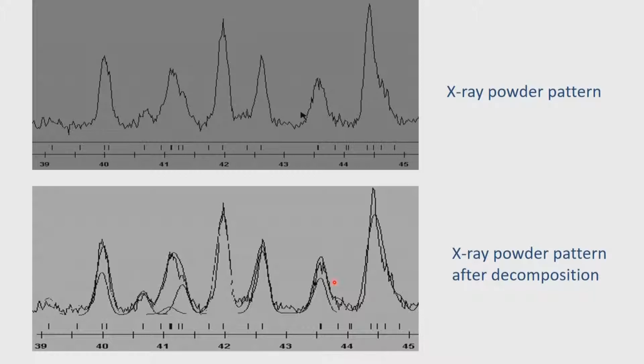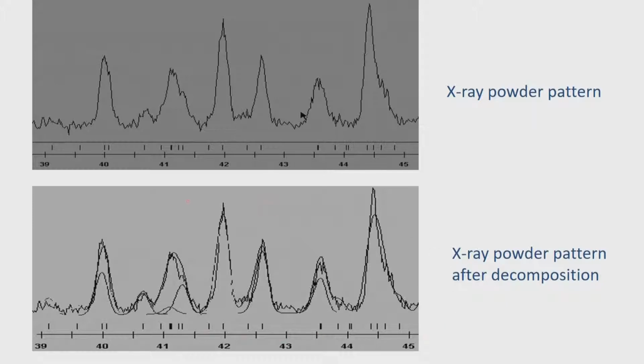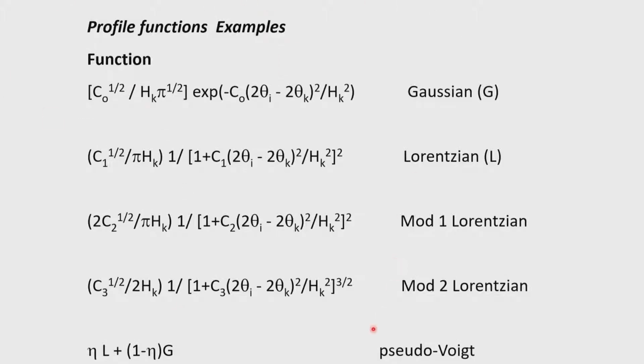So let us go further, and we see here the types of profile functions we can fit. We have to get a function which looks like this. Let us take this function, this is the profile associated with this reflection. In order to get that profile function, we need several parameters, and those parameters are supplied mathematically by these following functions.